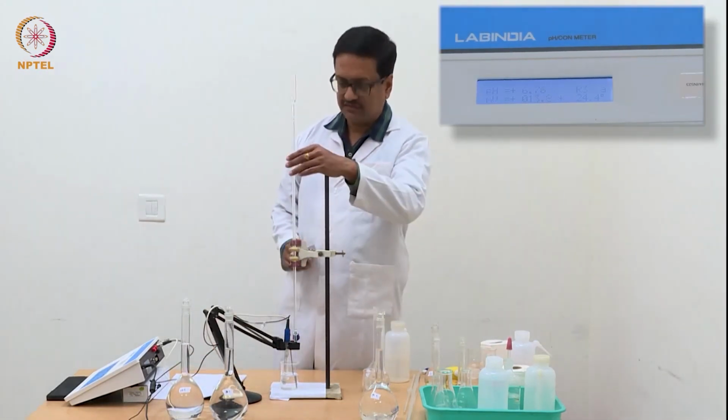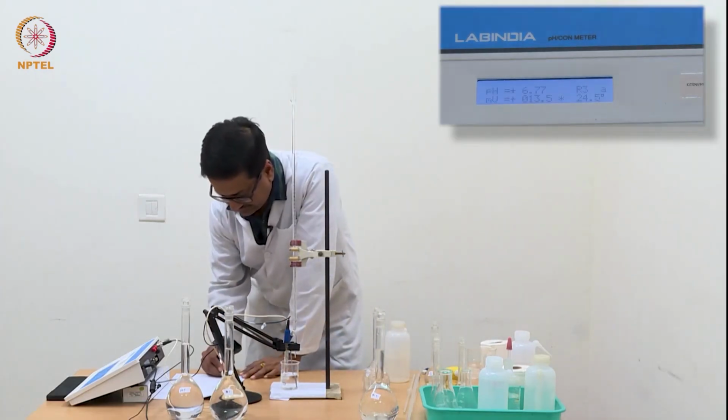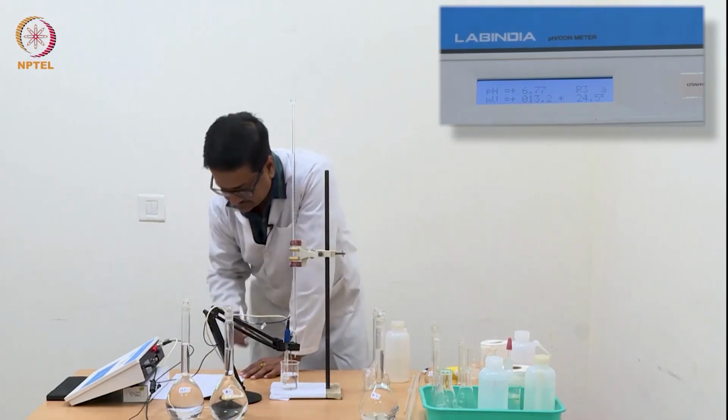Now we have reached 1.34 ml and the pH is 6.77.